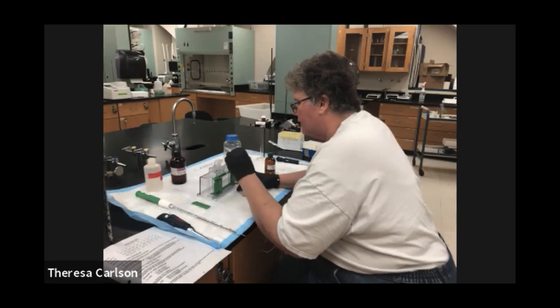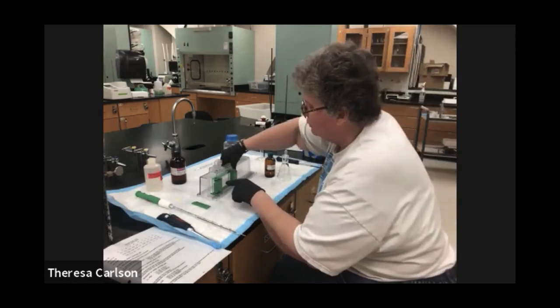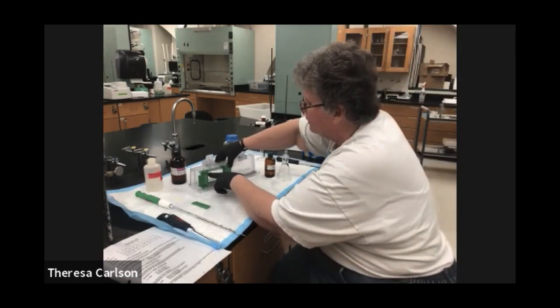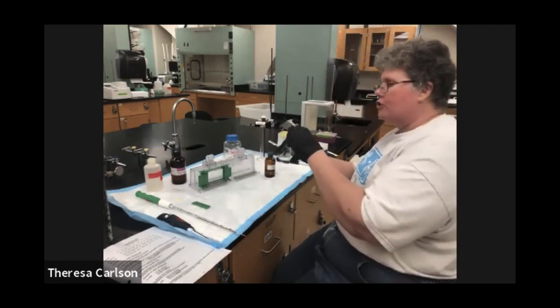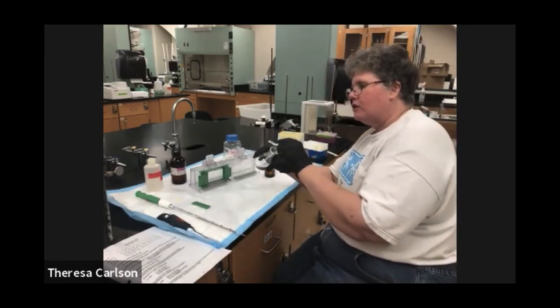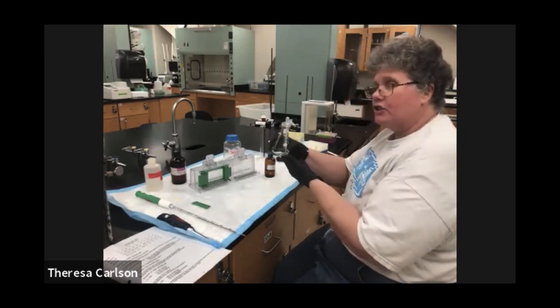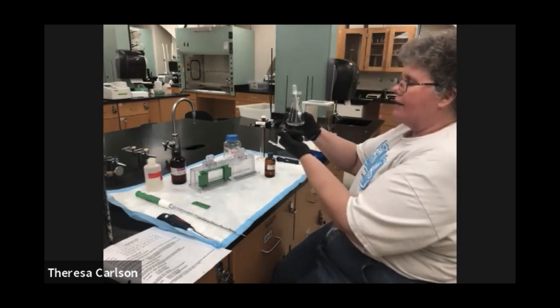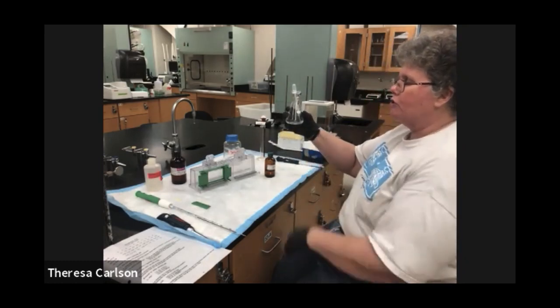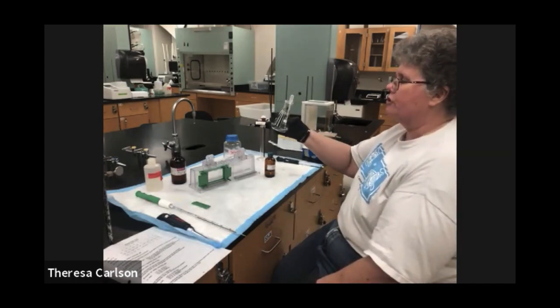Okay, so now I've got the acrylamide solution just below that little black mark that I made. And I have a couple bubbles there, and I'll show you what to do in a moment. I've also got my pipette full of solution. And that's important because oxygen inhibits polymerization of the acrylamide. So as the oxygen is exposed to the acrylamide, you will have a layer here that will never, ever solidify.